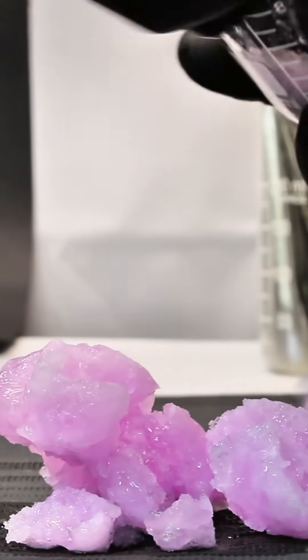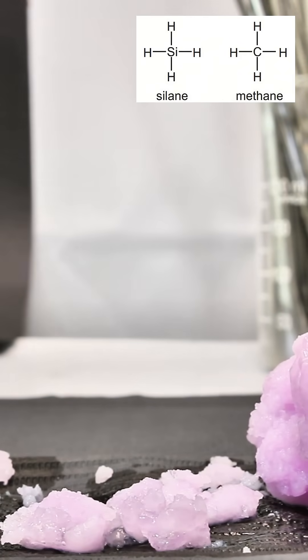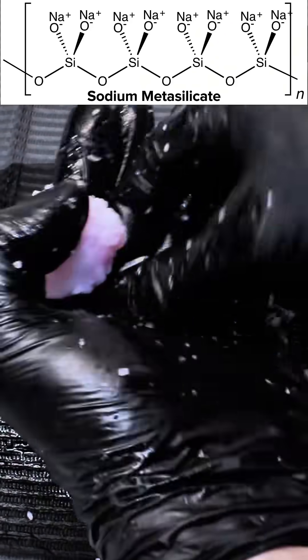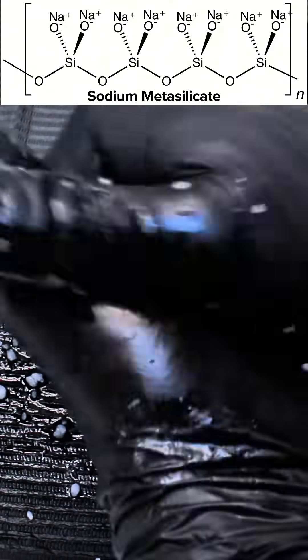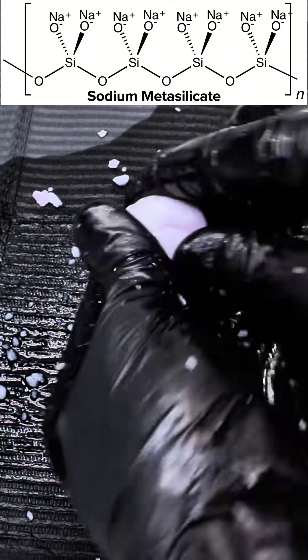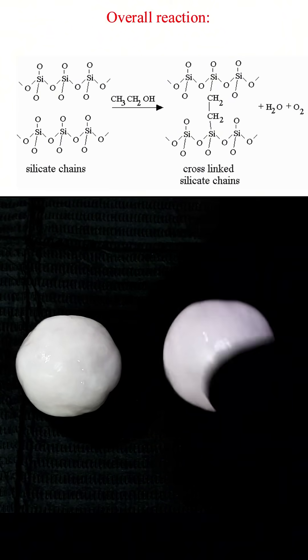The reason this is possible is because silicon is very much like carbon in that they both prefer to form four bonds. This allows both elements to form the backbone of large polymer chains, and while most plastics are carbon-based, you can do the same thing with silicon. A silicon-based plastic is called a silicone, and the simple reaction between ethanol and sodium silicate created this one.